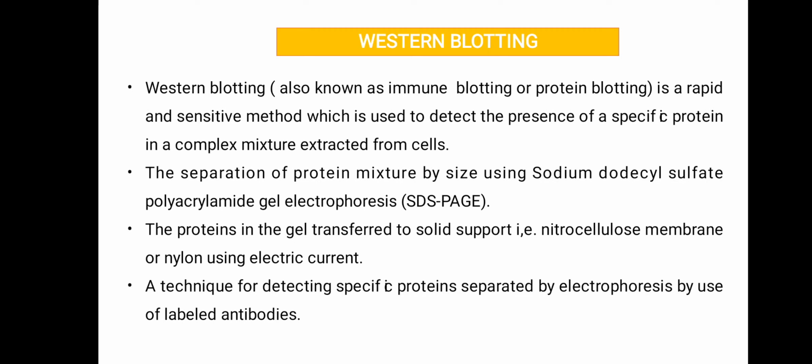A technique for detecting specific proteins separated by electrophoresis by use of labeled antibodies. So I have to remember, Western blotting is a technique used to detect specific proteins in a complex mixture extracted from cells. You have to remember: specific proteins are detected by Western blotting.